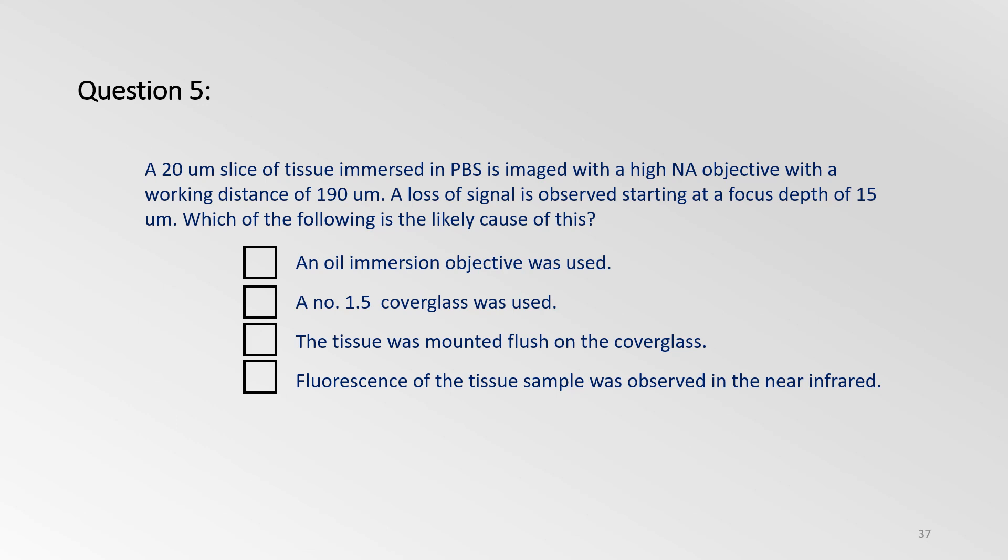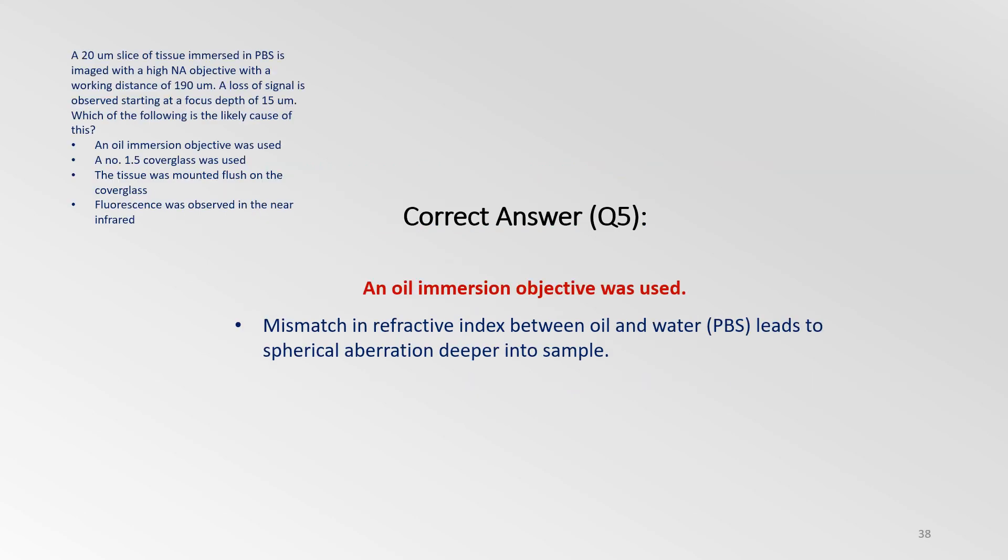Let's try one last question. A 20 micron slice of tissue immersed in PBS is imaged with a high NA objective with a working distance of 190 microns. A loss of signal is observed starting at the focus depth of 15 microns. Which of the following is the likely cause of this? An oil immersion objective was used. A number 1.5 cover glass was used. The tissue was mounted flush on the cover glass. Fluorescence of the tissue sample was observed in the near infrared. The loss of signal observed at a focus depth of 15 microns is mainly due to spherical aberration. And this is because an oil immersion objective was used on a sample containing PBS, which is basically aqueous. This mismatch in refractive index between oil and water leads to spherical aberration deeper into the sample.